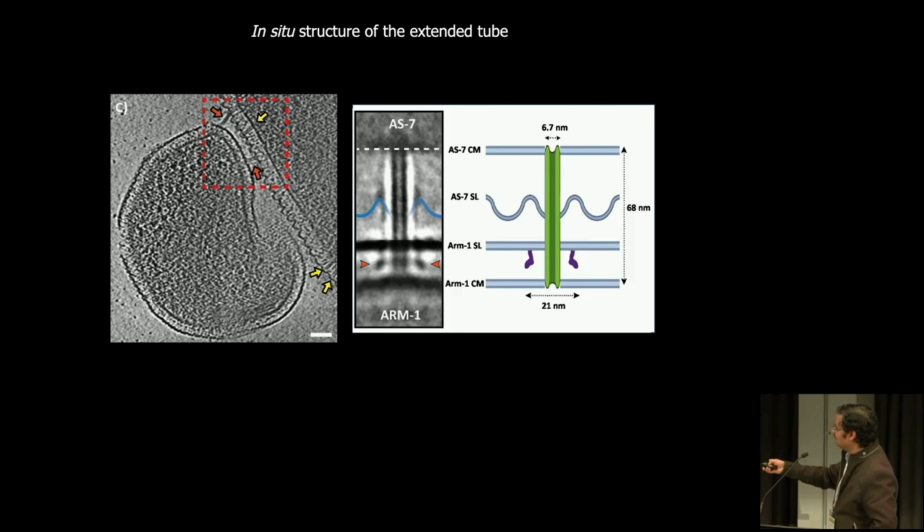So somehow this cell has already identified that there's something coming out from the host cell. And then it has formed this docking station so that the tube can dock there and connect the two cell cytoplasms so that they can exchange material. So there's probably some sort of really elaborate signaling or cell-cell communication going on there.